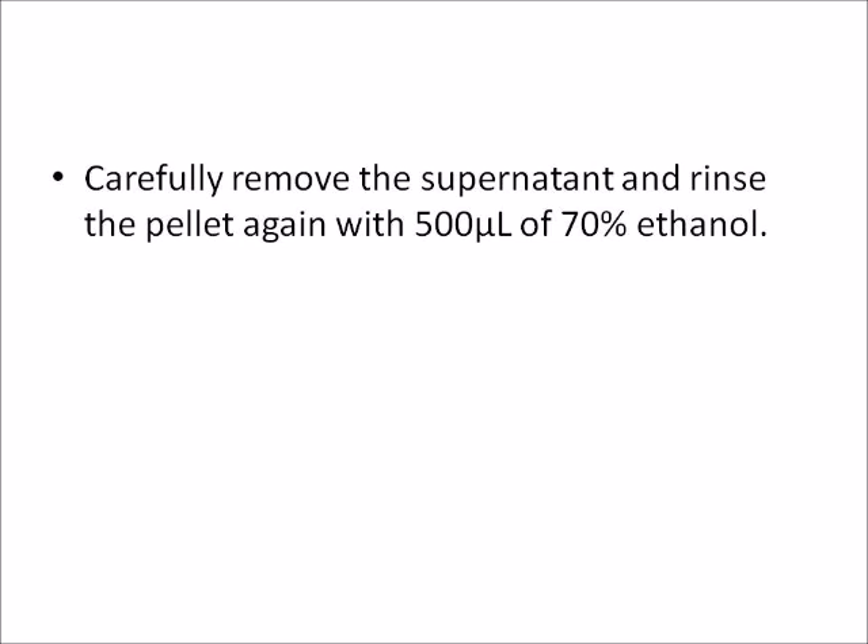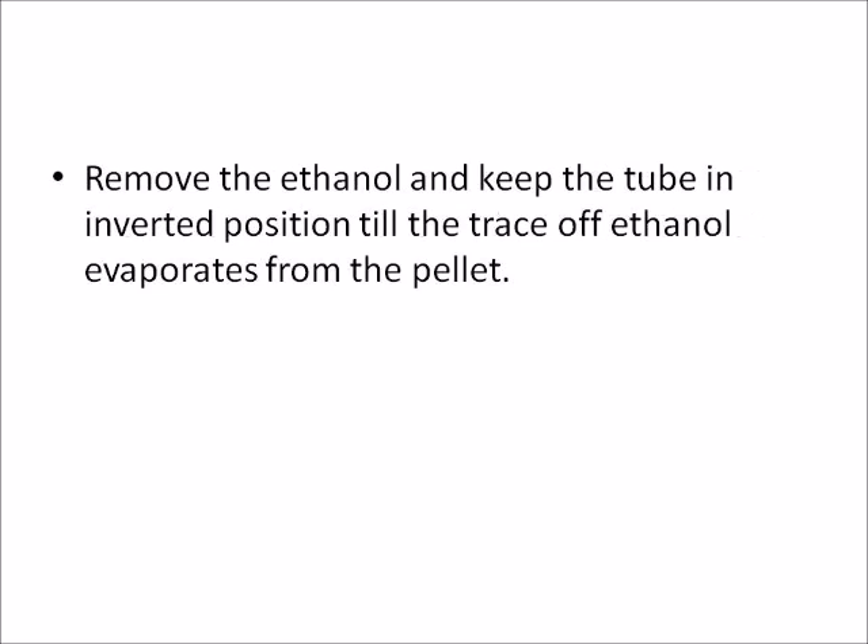Carefully remove the supernatant and rinse the pellet again with 500 microliters of 70% ethanol. Remove the ethanol and keep the tube in inverted position until the trace of ethanol evaporates from the pellet.